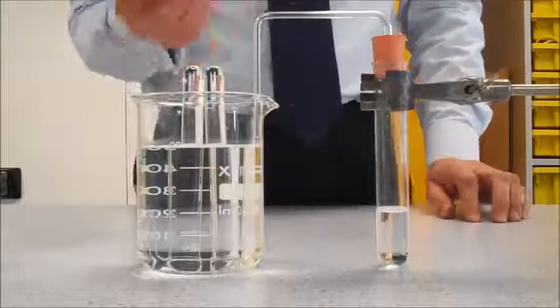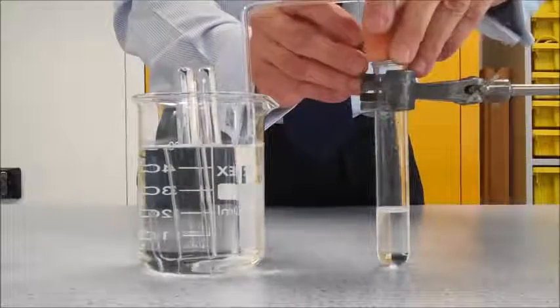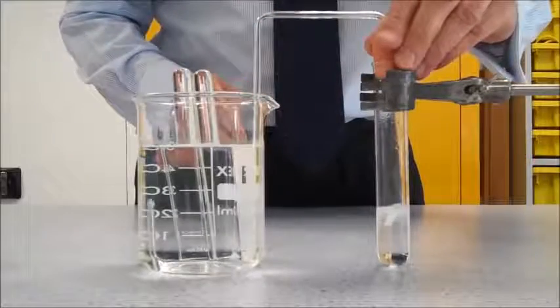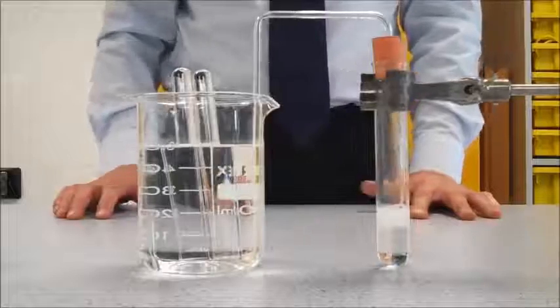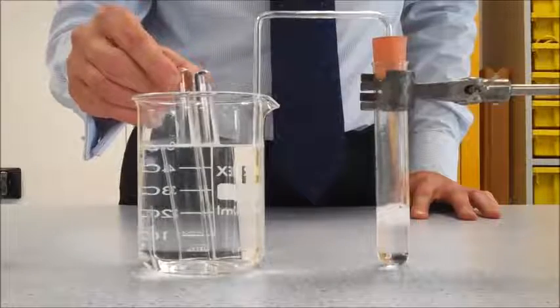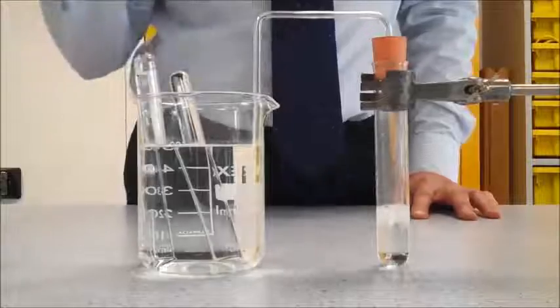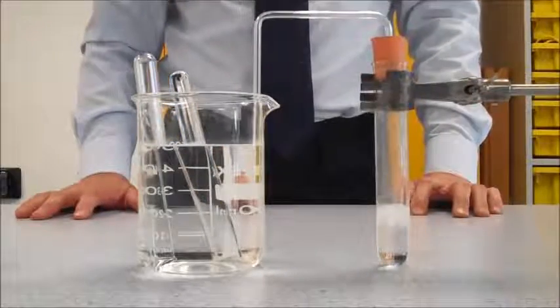For this demonstration, I am going to react hydrochloric acid with magnesium, which of course produces hydrogen gas. The beaker acts as a water reservoir in which there are two upturned water-filled test tubes. If one of these tubes is placed over the end of the delivery tube, every bubble of gas can be seen as it is produced.